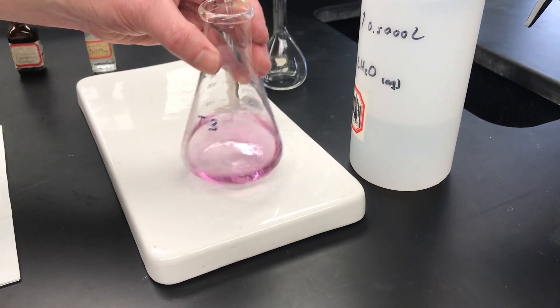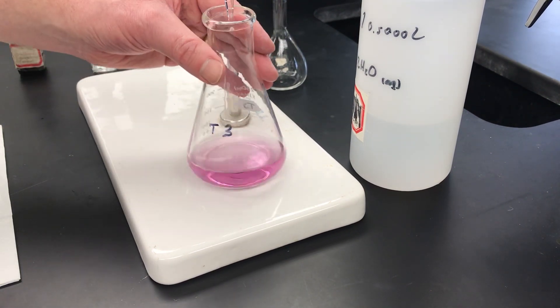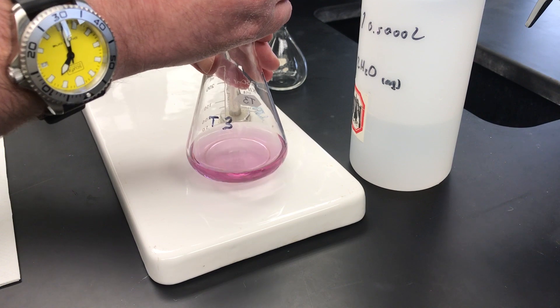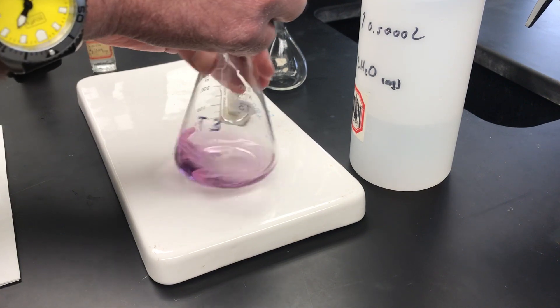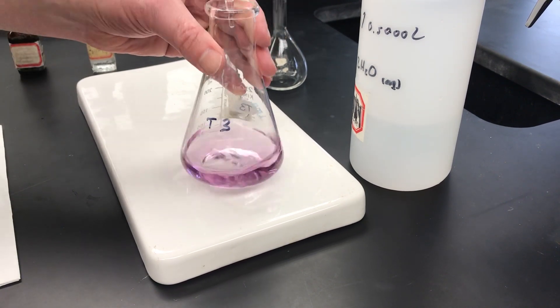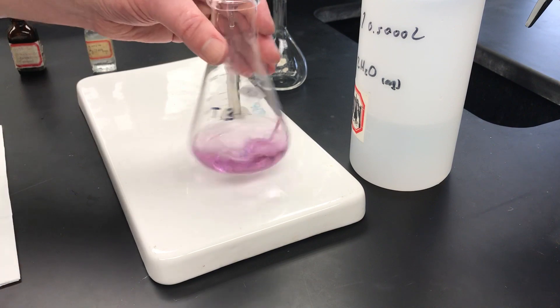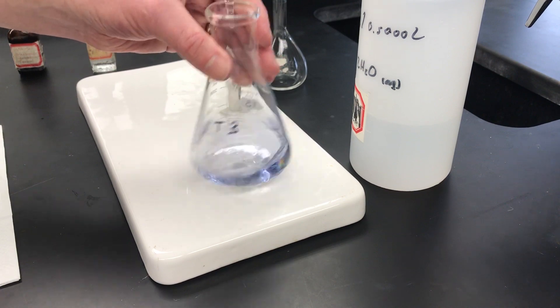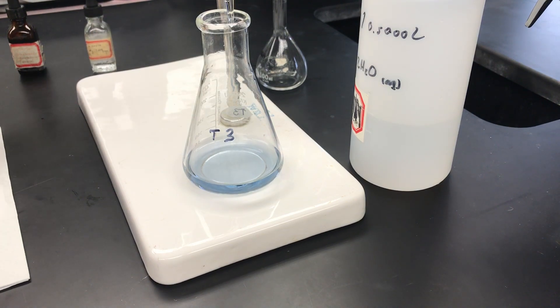It looks like I'm about there — you can actually see the change now going from pink to more of a purple. I'm going to slow down and go drop-wise. There's a drop — perhaps a little bit darker. I see more purple now so maybe another drop or two should do it. There we go — you can nicely see that purple, and there's the blue. That's what a good end point looks like. We've gone through the reddish pink through the purple to what looks like almost a sky blue.